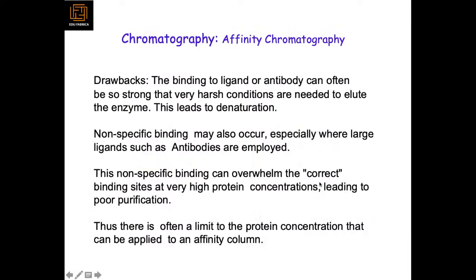There is a drawback of affinity chromatography: the binding to a ligand or antibody can often be so strong that very harsh conditions are needed to elute the enzyme. This leads to denaturation. Then non-specific binding may also occur, especially where large ligands such as antibodies are employed. This non-specific binding can overwhelm the correct binding sites at very high protein concentrations, leading to poor purification. Thus, there is often a limit to the protein concentration that can be applied to an affinity column.